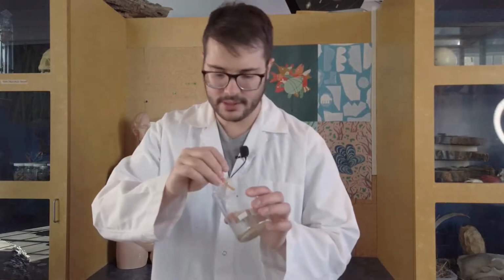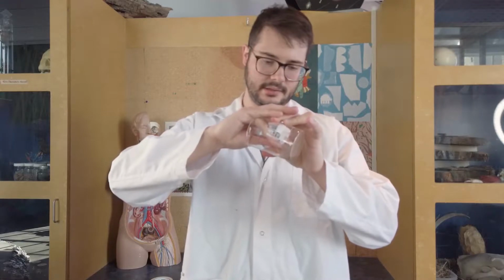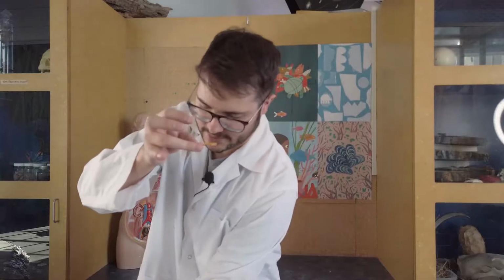So we have our litmus paper there. We are going to dip it inside of our liquid here. And we're going to let that sit there for a second. And we're going to see what color it ends up changing.